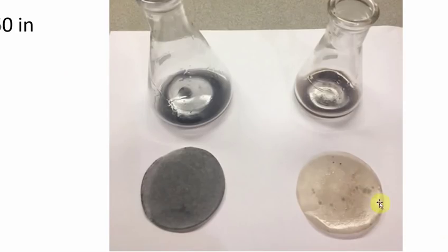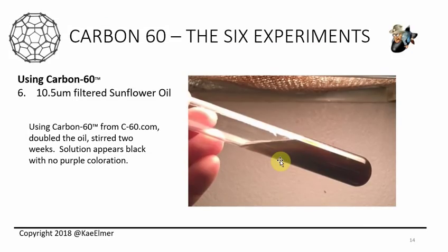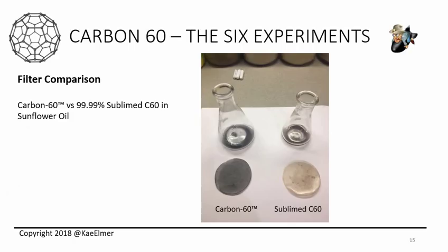And so this is the Sublime C60 over here. You could see that even though there was a residual in both flasks, all of this went straight through the filter, and there was nothing caught up. And then you could see where the actual Carbon-60 filtered out some of the impurities of the oil or the C60 that was floating in it. But at the end of the day, it still made it through the filter, and you actually end up with a Carbon-60 oil. It just doesn't look purple, and that's the end of that.